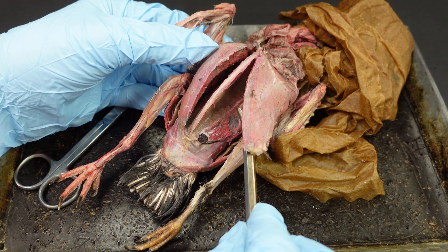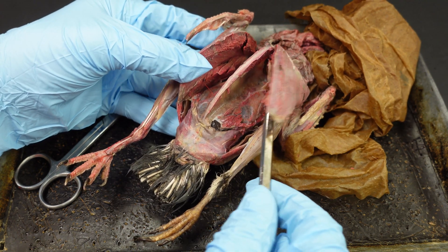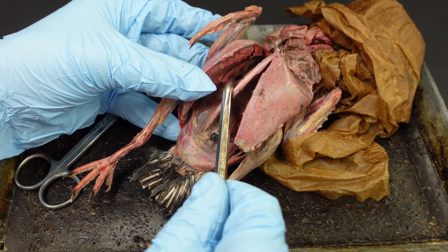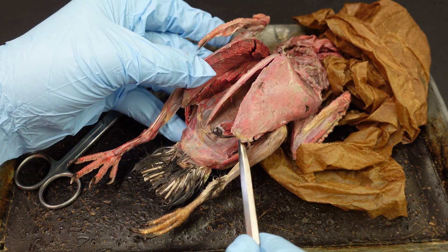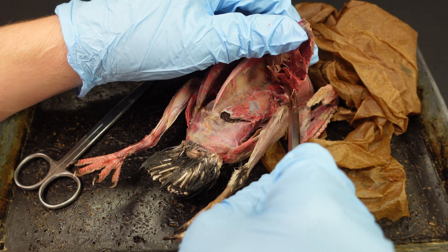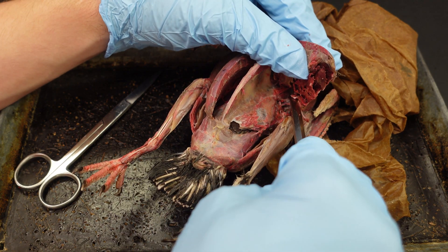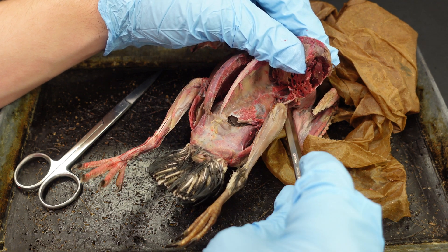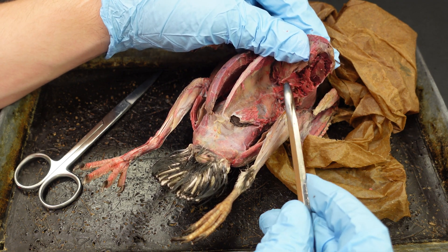Now we can see I have separated the pectoralis and supracoracoideus on one side — this one was already cut like we did for the muscle unit, so we can see the supracoracoideus deep below the pectoralis flipping out toward the wing. On the other side I've sliced through all the muscle so it flips up toward the head, more like what we did last year, and I can already tell there's quite a bit of tension on the arteries and veins. There's a real possibility they will tear.